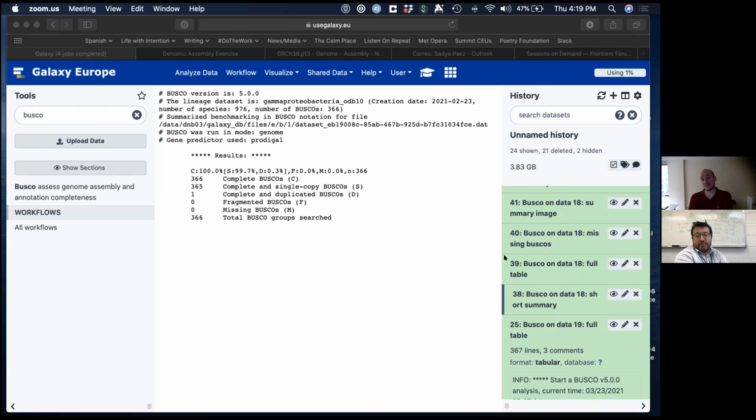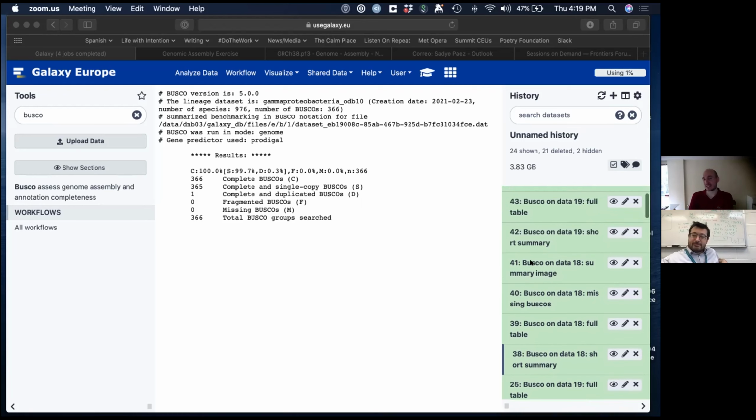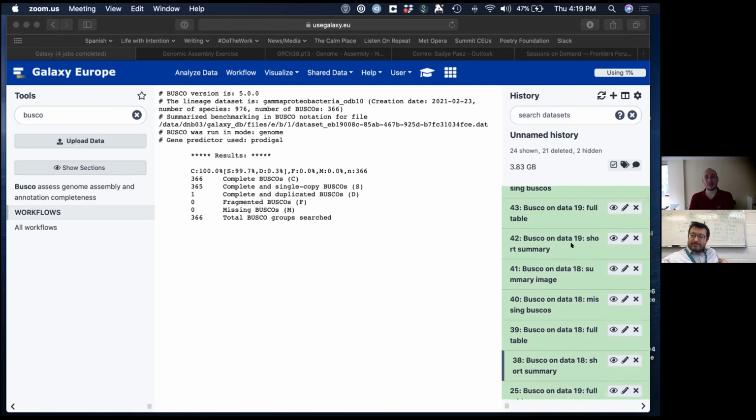That's the best assembly ever seen. It's E. coli. It looks really good. Well, before the advent of long reads, even E. coli was fragmented and there were missing genes. So this is really the result of long reads. If you compute the stats, you will see that this is assembled in a single sequence. So the entire E. coli chromosome is assembled into one sequence.